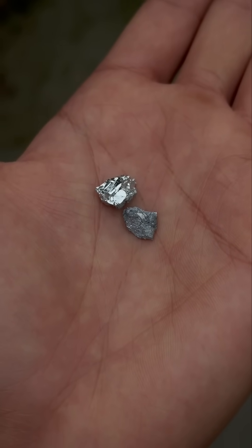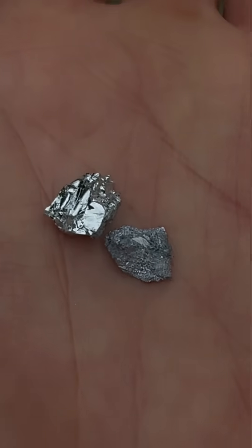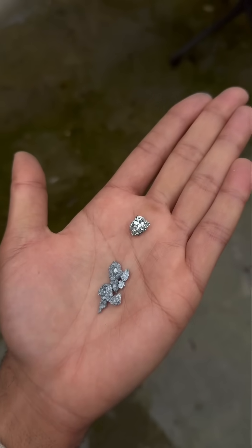The blue hue is quite subtle, but when you put it side by side with a piece of pure gallium metal, you can see there's a clear difference. That's the blue gold. And because of the gallium, it's a bit brittle.